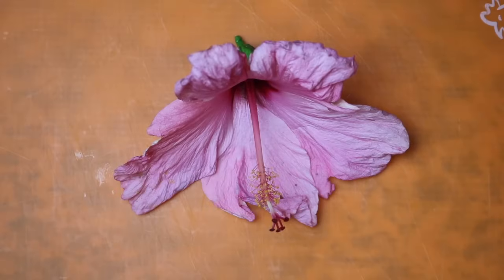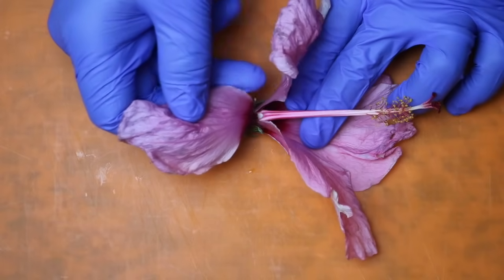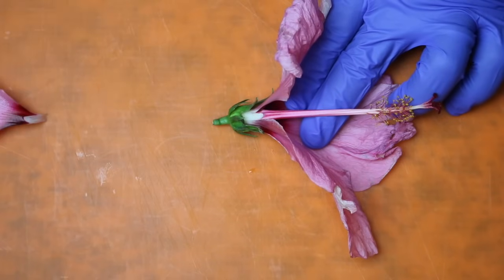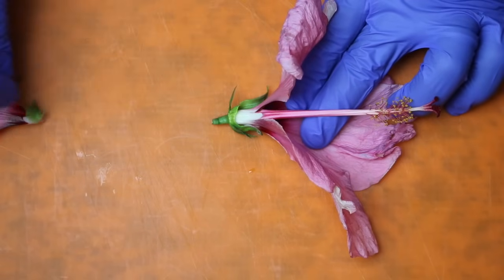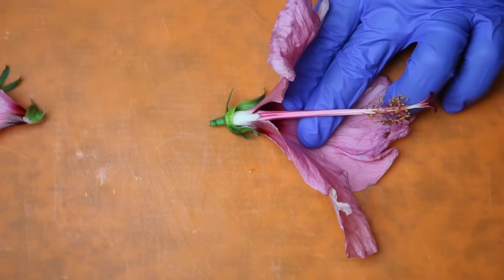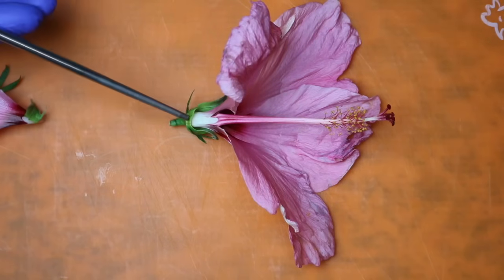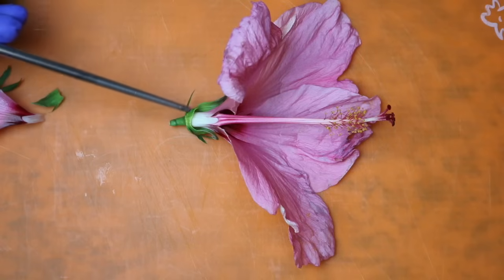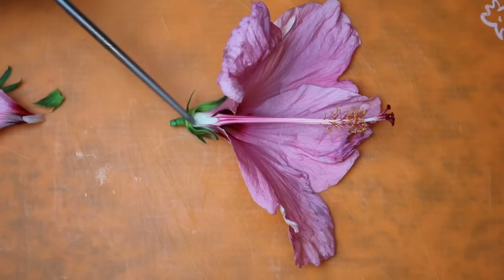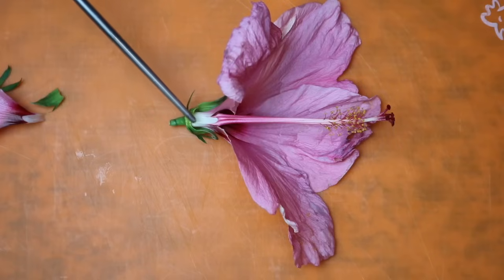Now that we've familiarized ourselves with the general parts of the flower, we can go ahead and get dissecting. We're going to take our flower and remove one of the petals — just pull it back gently like this — and then remove those sepals that are in the way. This allows us to get a cleaner cut as we get inside the flower. Right in the center is what we call the ovary, and in the ovary there are ovules — those small ovules are what will turn into the seeds of the fruit for the plant.